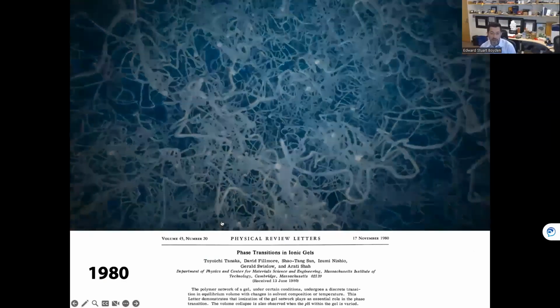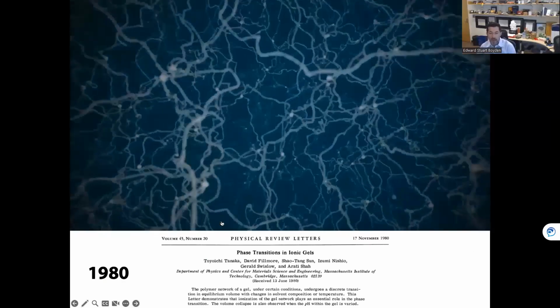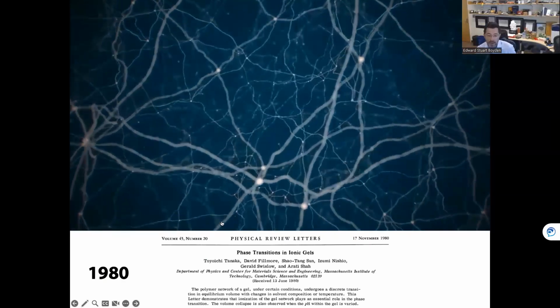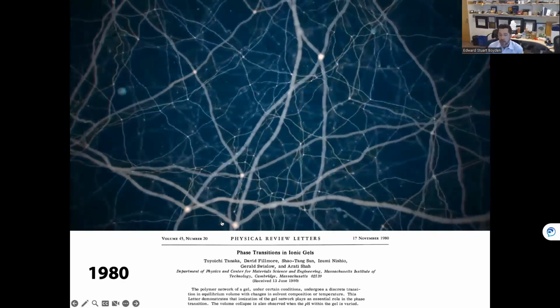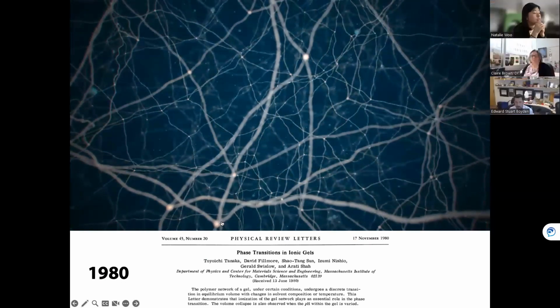You could take sodium polyacrylate, a highly charged polymer, the active ingredient in baby diapers, add water, and the water is drawn in through osmosis. The polymer threads are highly charged, and they separate apart from each other. This gives an enormous expansion within a matter of minutes. Furthermore, the physics of this is well behaved, and that was one of the things that got us thinking, well, maybe this is something that we could try to apply to evenly expand a biological system.